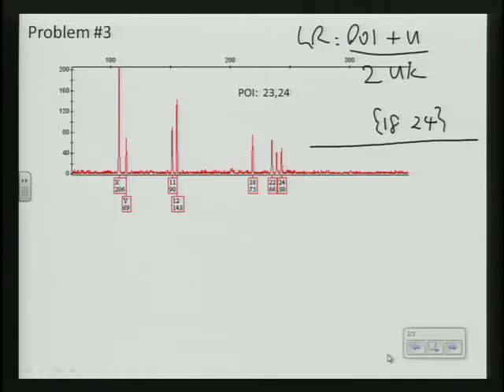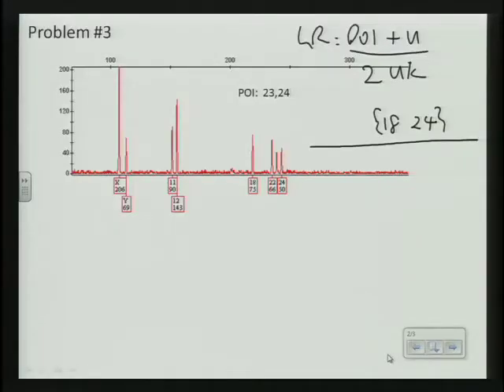Okay. Now, given we're not going to have that peak at 23, are we confident we've got full representation of a 2-person mixture? Then you've got to say no, and we've got to invoke an F, a missing allele. Sorry, I'm looking at the wrong thing. I beg your pardon. We've got the 24 in, so you're right. I've got to account for the 22. I'm glad some of us are awake.